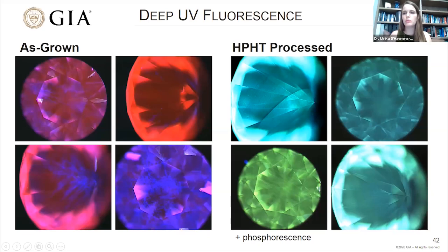And if we think back to what a standard natural diamond would look like, you would instead be seeing blue fluorescence most commonly, and this polygonized dislocation pattern for the diamonds that are high purity.